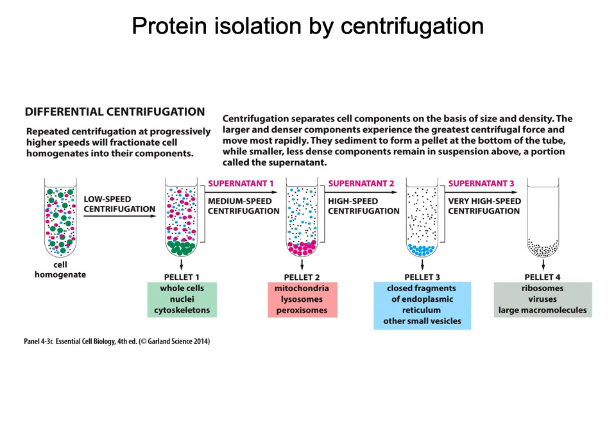The newer ones are smaller than the old-fashioned ones. High-speed centrifuges are definitely going to have warning labels on them to be extremely careful. Things at high rates of speed can harm you if not properly balanced. And these ones, again, are usually larger ones that would be standing on the ground, not on the bench top.